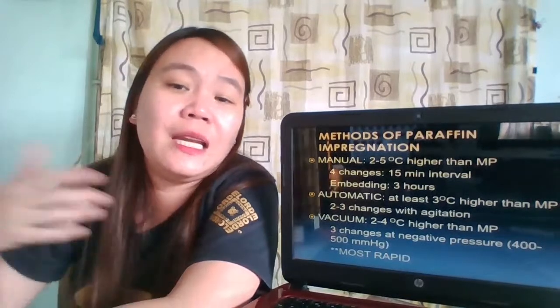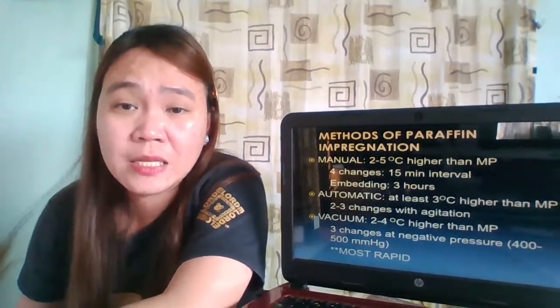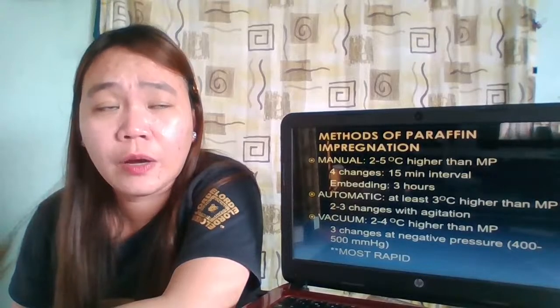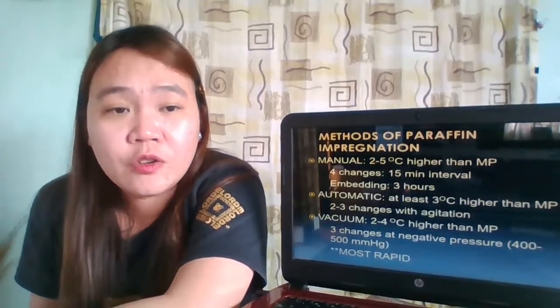So this will facilitate the easier removal of air bubbles as well as clearing agent that is present in your tissue sample. So I repeat, it facilitates easier removal of air bubbles and clearing agent from your tissue sample.